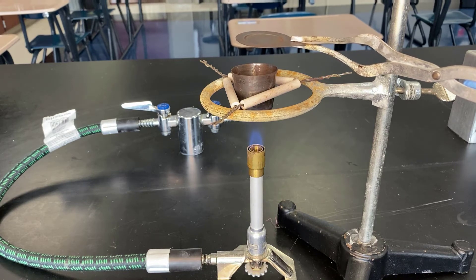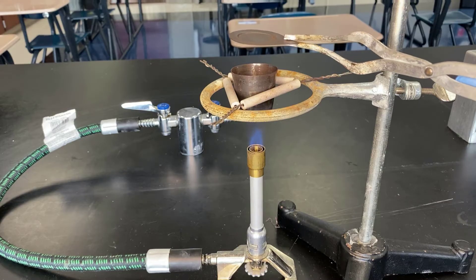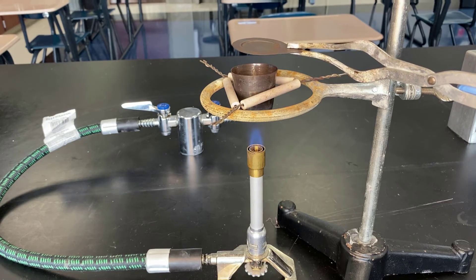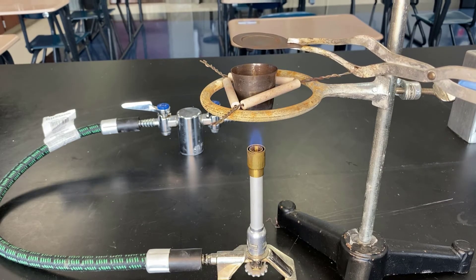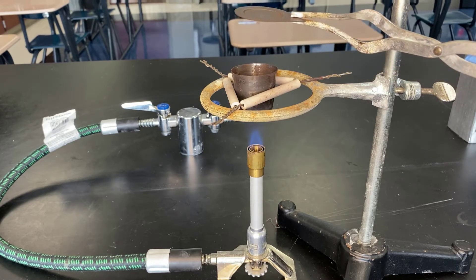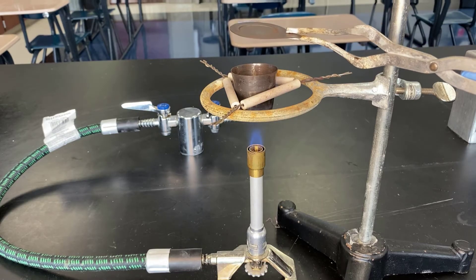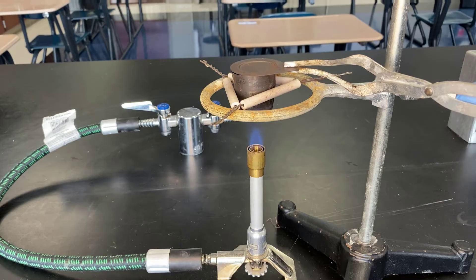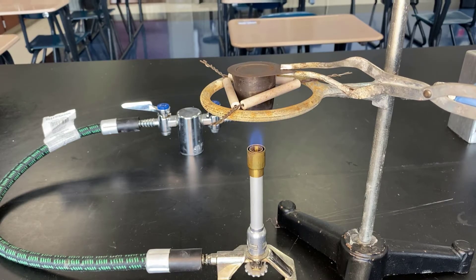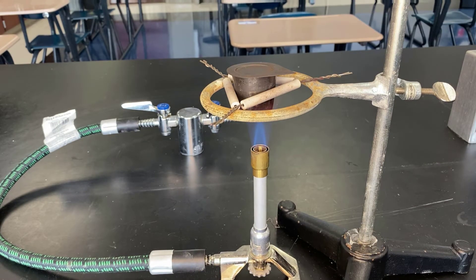Anyone that's ever lit magnesium ribbon on fire with a Bunsen burner knows that it is very, very bright and produces a tremendous amount of magnesium oxide very quickly. We're trying to do it much, much more slowly. And if too much oxygen rushes in and the magnesium is too hot, then what's going to happen is we're going to see that nice little fireball that you'd normally see with just burning ribbon. We're trying to avoid that.